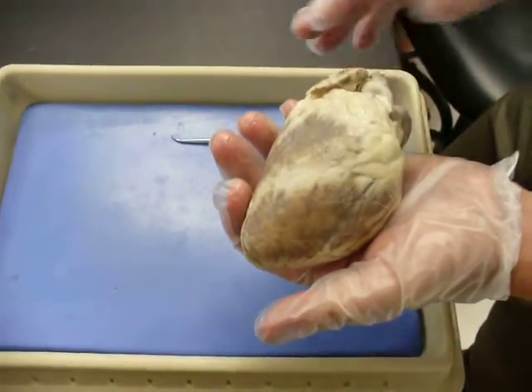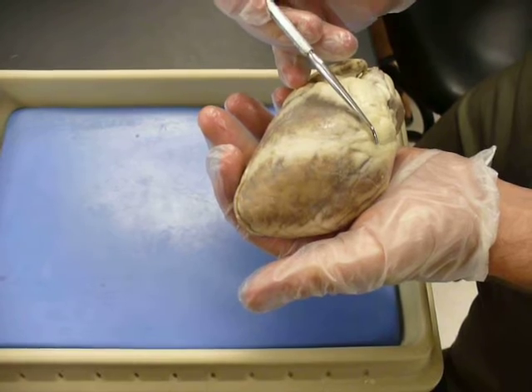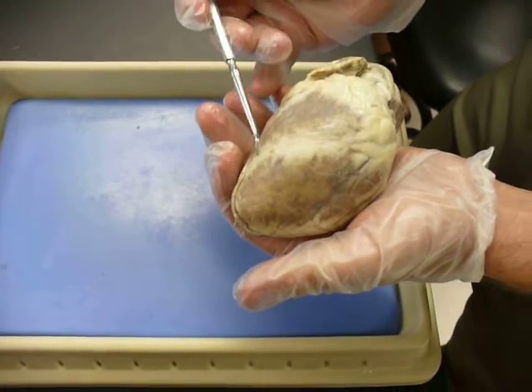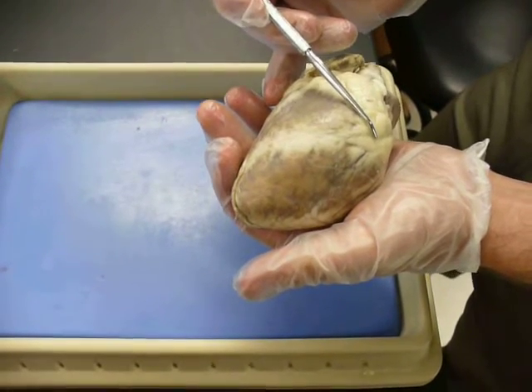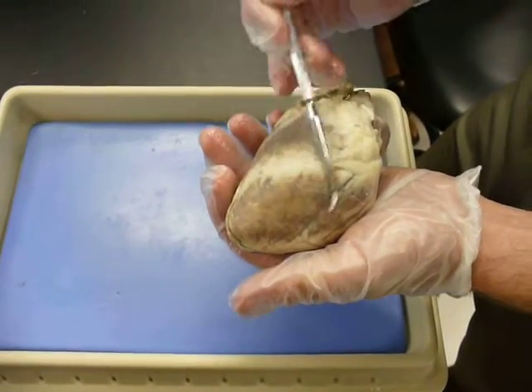This is the anterior of the heart. One of the first things to look for is this anterior interventricular sulcus that runs right down through the center. It's going to divide your two ventricles — your right ventricle from your left ventricle.